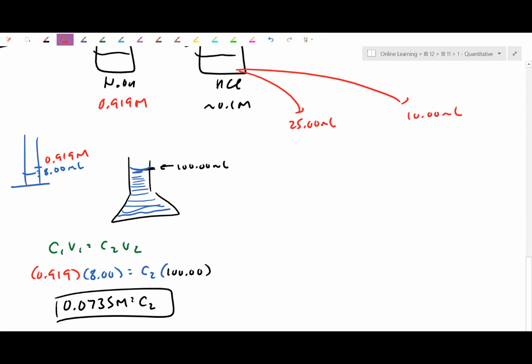Based on my titration here, I'm just going to give you the data again. The V1 from the base here was 16.22. The V final, so what did the burette say? This was the one that was really pushing it. It was getting really close to that bottom. I'm sort of lucky that it actually didn't overdo it there. But let's take the difference in volume. 49.23 minus 16.22. This gives you, in total, 33.01 milliliters.